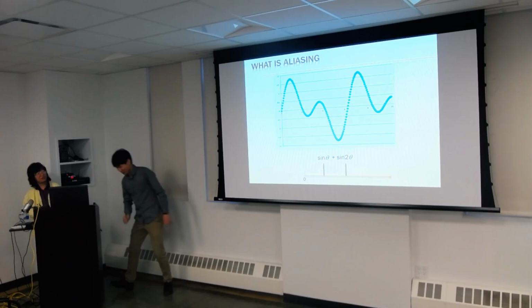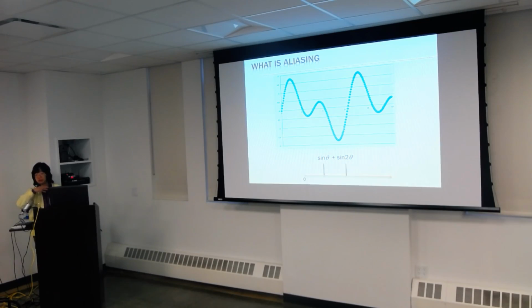So if we try to describe this particular wave with only one term, then what am I going to do? Intuitively you would say I'm going to fit this whole thing with one sine wave, right? So that's exactly what you do in a Fourier transformation.